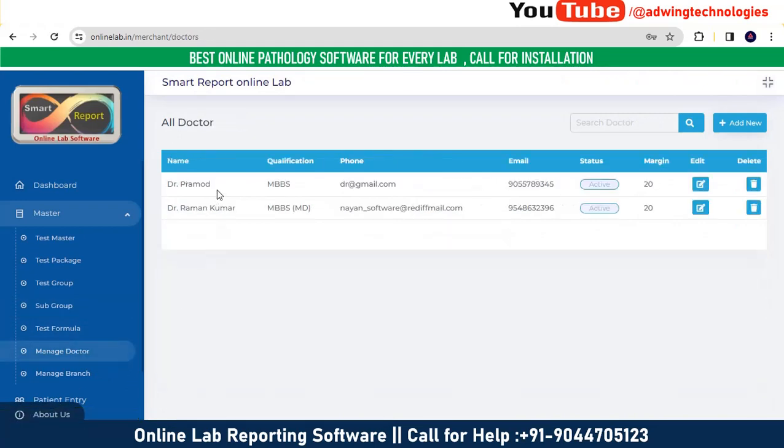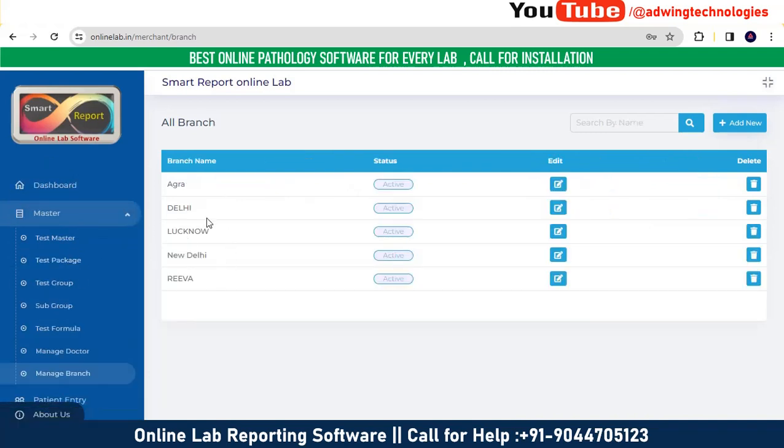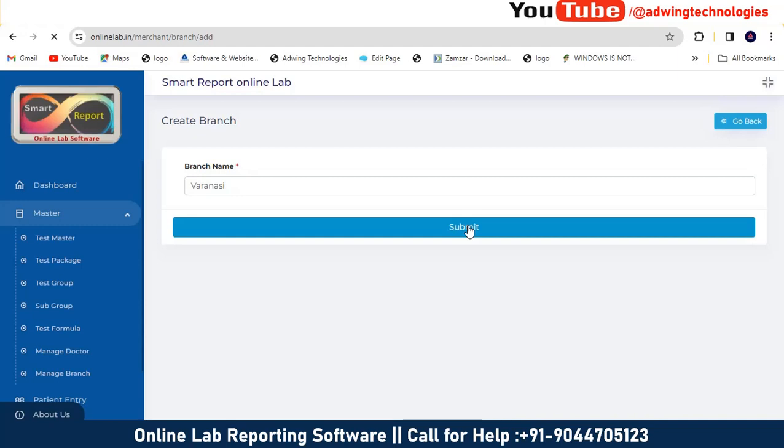Manage doctor. You can manage so many doctors here. You can add many branches as well. If you have branches like Agra, Delhi, Lucknow, New Delhi, Rewa, and you want to add a new branch, you can add it here, like Varanasi, and just submit it. Your new branch is added successfully.